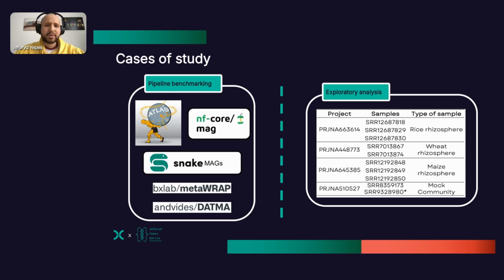And there is even another application because, as I mentioned before, within the bioinformatics workflow, you use binning software. These are, for example, MetaBAT2, MaxBin, and now some other tools, SemiBin. And then you can compare only the output of these tools to see how they are behaving, and you don't have to run the whole pipeline.